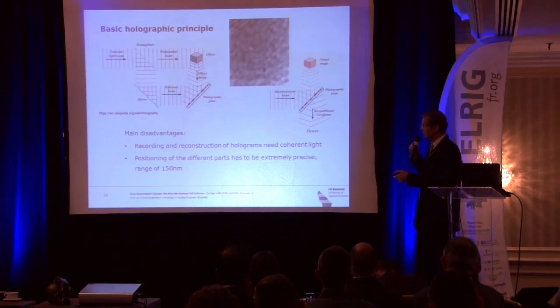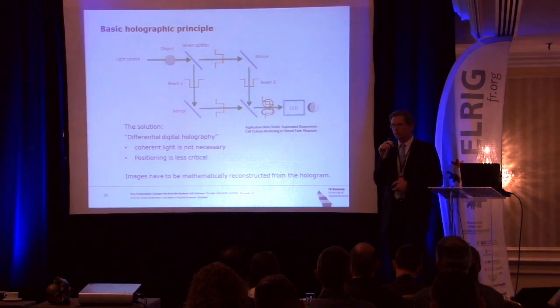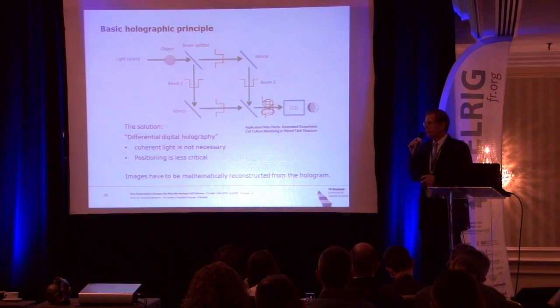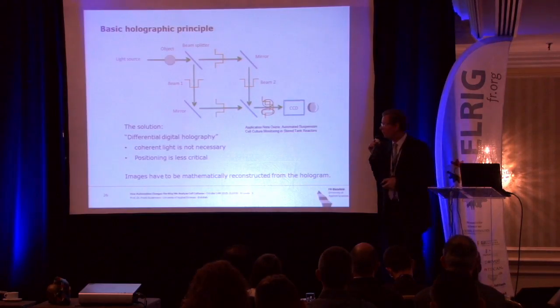In this instrument here, it is very crucial to place the mirrors according to the object in the right position. This technology has been modified by the companies that use these technologies, and in principle, the object is no longer here inside this array of different mirrors. It is set in front of the mirror. That creates another problem that you have to use calculation power to calculate the real hologram. But that's possible now.